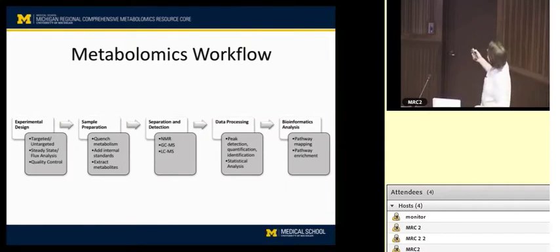The majority of the stats analysis and the pathway mapping and such will be talked about by Ala and George this afternoon. And I mentioned that because one of the things that happens sometimes with untargeted metabolomic studies is that what we can do for a basic analysis maybe doesn't incorporate all of the factors that you have, because a lot of times people will give us a couple of factors, but really there's all this clinical data that they have that maybe needs to be considered.